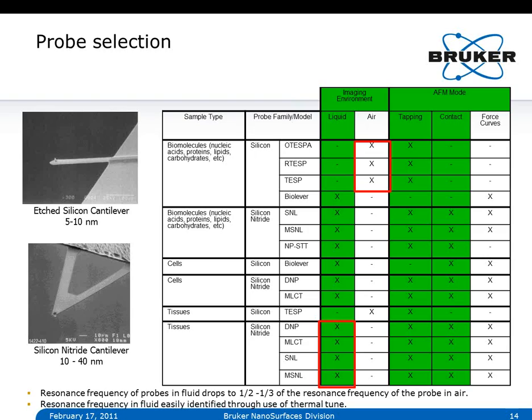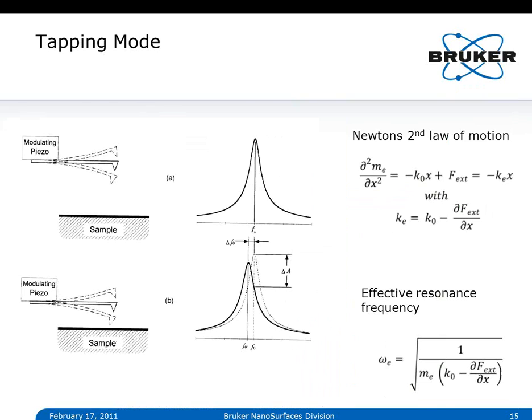And at the bottom, you see that in liquid environment, again the same probes are actually selected that we used for force measurement. So, a rather interesting fact here, we also want to keep in mind that the resonance frequency of a probe drops significantly when we move the probe from air into fluids, and so does the Q factor. And we're going to look into this.